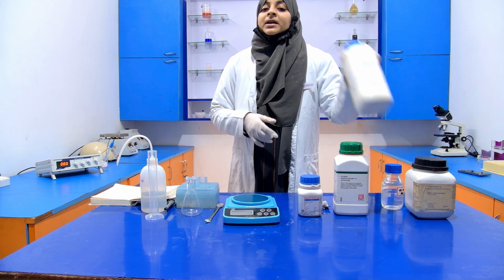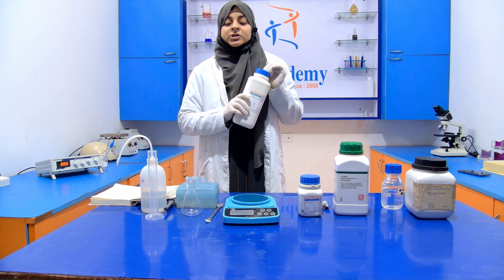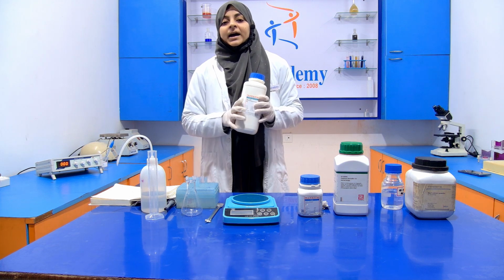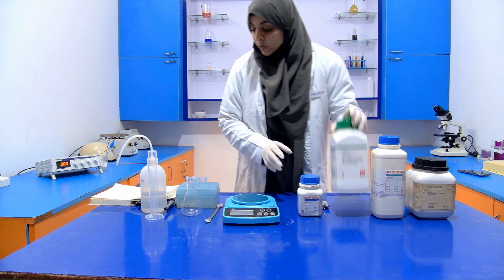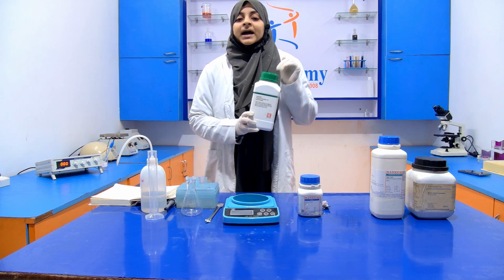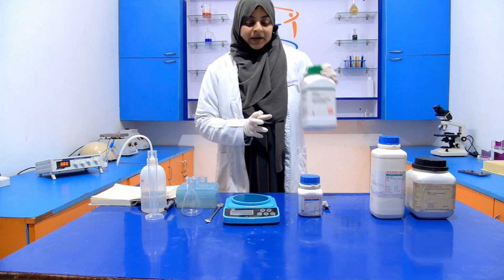Basically, the first chemical, agar, is used as a solidifying agent. In media preparation, the role of the agar is what? It is used as a solidifying agent. Then peptone is used to provide nitrogen, which is very important for the growth of the microorganism.